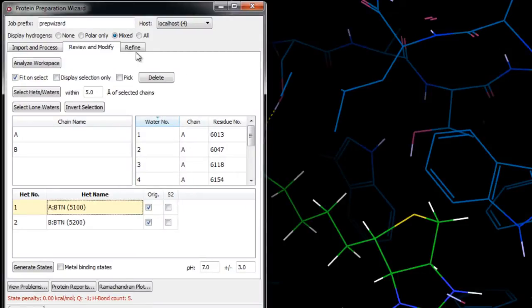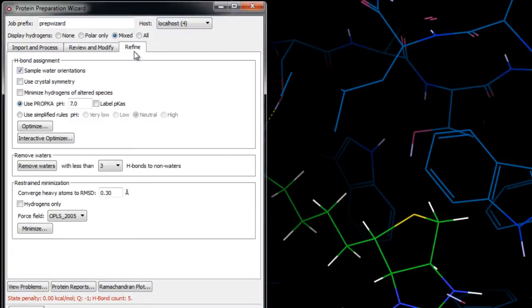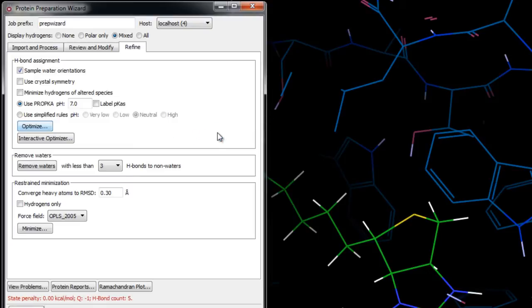So now let's go to Refine. Here we'll click Optimize in the H-bond assignment section. Optimizing the hydrogen bonding is important because X-ray structures do not usually have enough resolution to fix the orientation of terminal amides or histidines, or the orientation of hydroxyls and thiols.